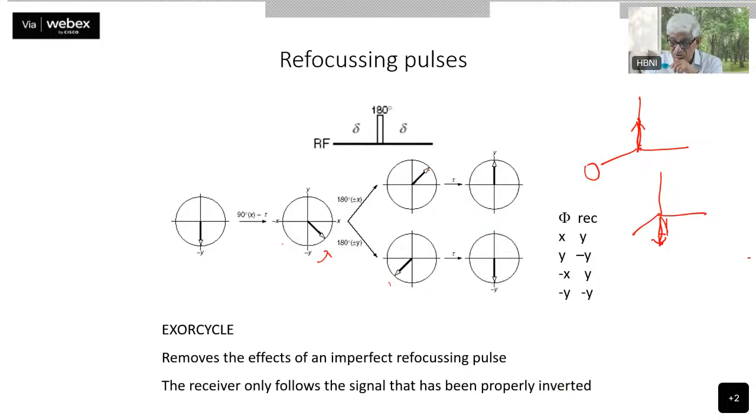Okay, so what you are trying to measure is the component in the z-axis, the 180 degree that has come. It will be slightly reduced in intensity, but nonetheless, this component which has come here, suppose it is along the... made a rotation along this, the magnetization has rotated from here to here. If I applied a pulse here, now it has generated a component along this axis here, in the positive axis here. Now I do a second experiment where I apply the pulse along here.